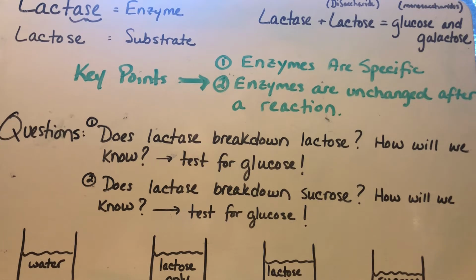So our two big questions for the lab today that we're going to investigate are, number one, does lactase break down lactose? How are we going to know this? We're going to test for the presence of glucose, and I'm going to show you how we do that in a second. And number two, does lactase break down sucrose? Sucrose is another disaccharide. It's what you know as table sugar. How are we going to know? We're also going to test for the presence of glucose there. So we're asking two questions here.